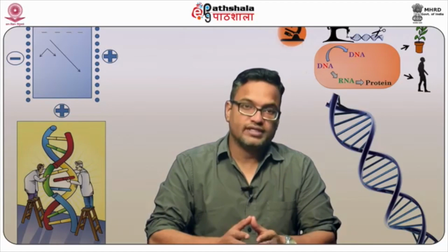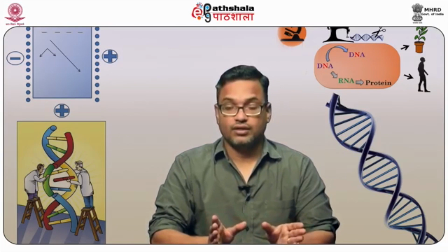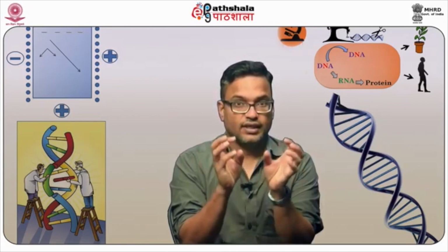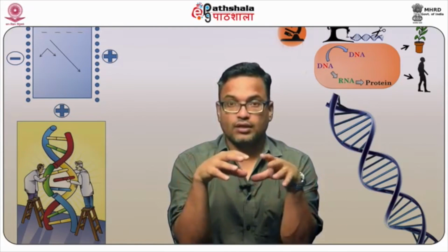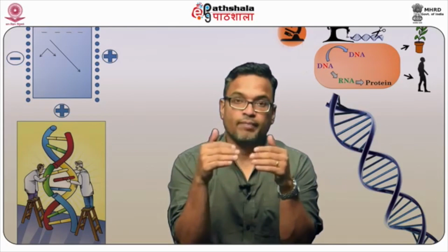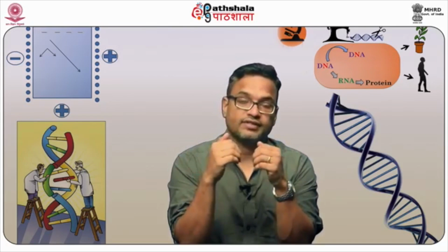What happens in both cases, the electron beam which is generated by an electron gun is accelerated via an anode, and by using electromagnetic lenses, it is targeted on a sample. Now the sample will either transmit the beam, and that signal will be used to generate an image, or it could scatter depending upon the way it interacts with the surface and the complexity of the sample.